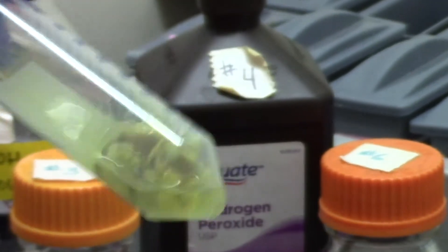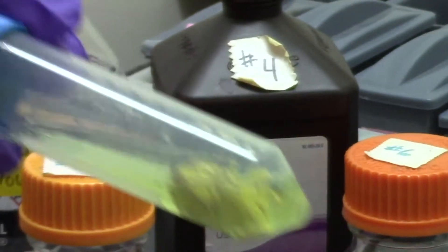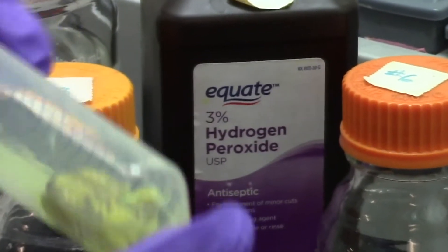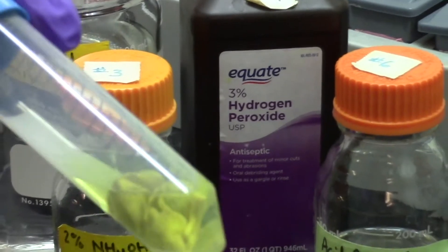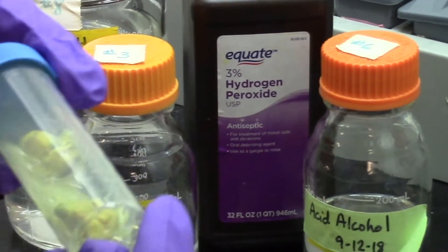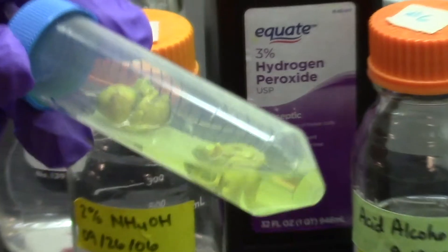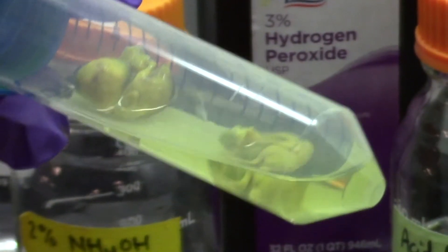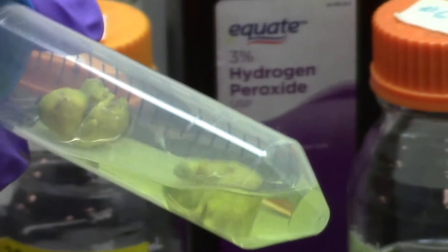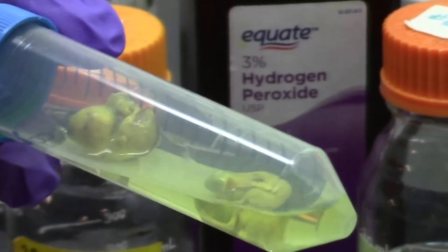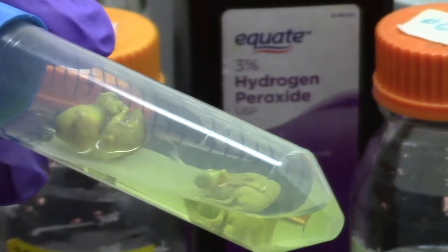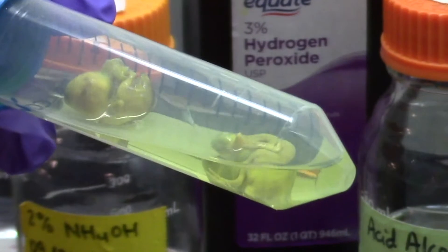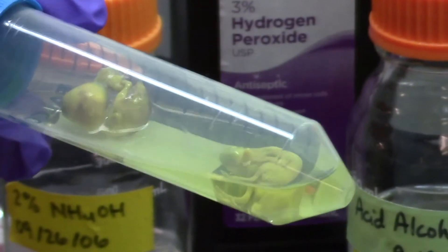At this stage, these embryos have a skull, they have a backbone and vertebrae, they have legs and limbs and toes. So you'd expect some bone to be in there. But these very small embryos actually also are mostly making their long bones through chondrogenesis. In other words, they start making these endochondral bones by first of all laying down a cartilage matrix and then replacing the cartilage cells with bone cells. And so we'll be able to label basically their entire skeleton at this stage of development.